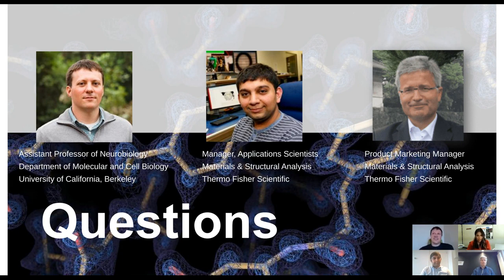Okay, thank you. Then a question for Abhay: was the streptavidin dataset also collected with the Cold FEG, or only Falcon 4 and Selectris? The streptavidin data was collected with the Cold FEG, Selectris, and Falcon 4. Okay. And given the same conditions, sample, grid, and detector, what would be a typical difference in the overall resolution range expected in a dataset collected on a Krios and Glacios?